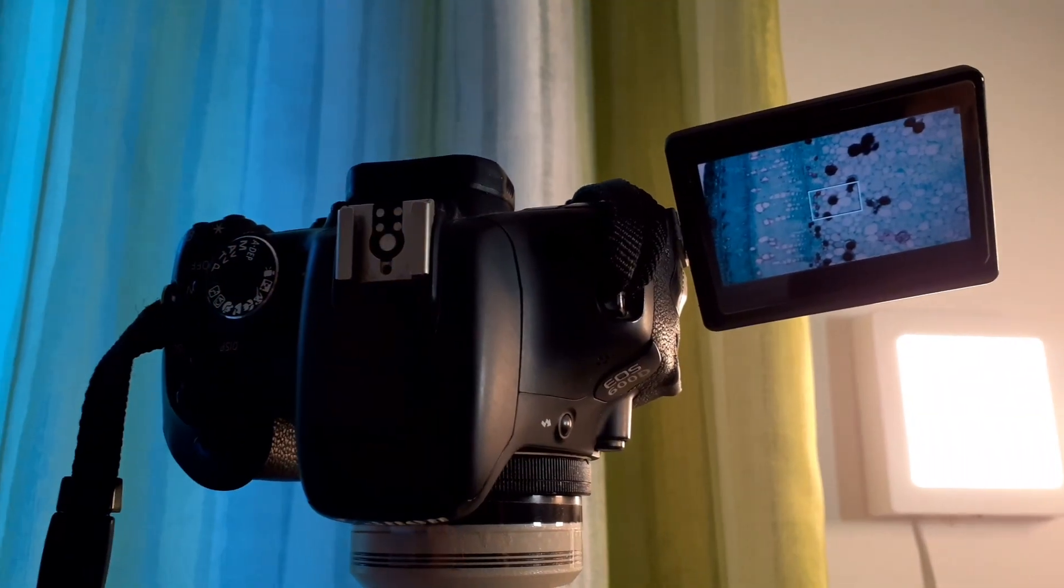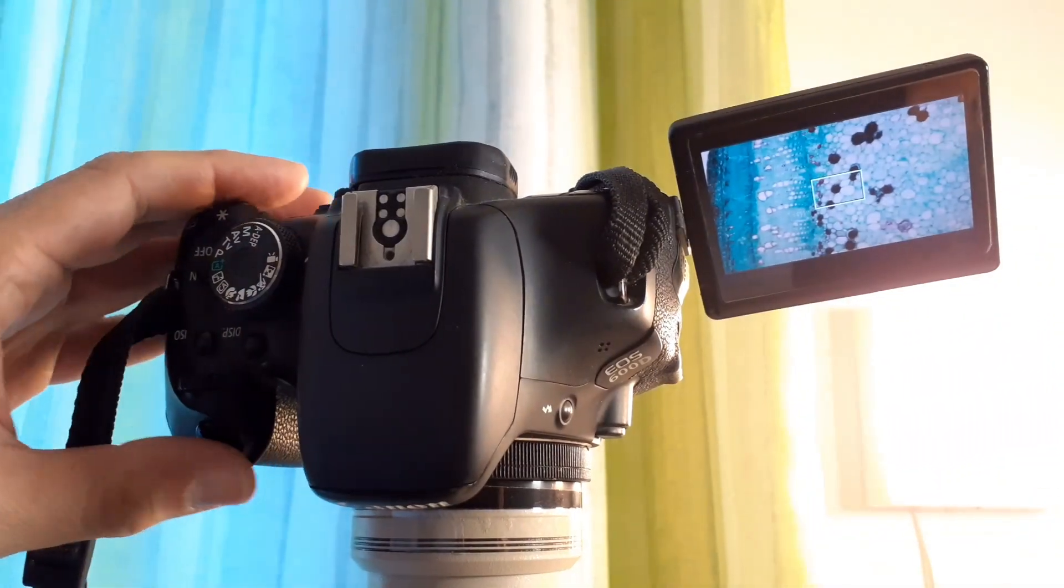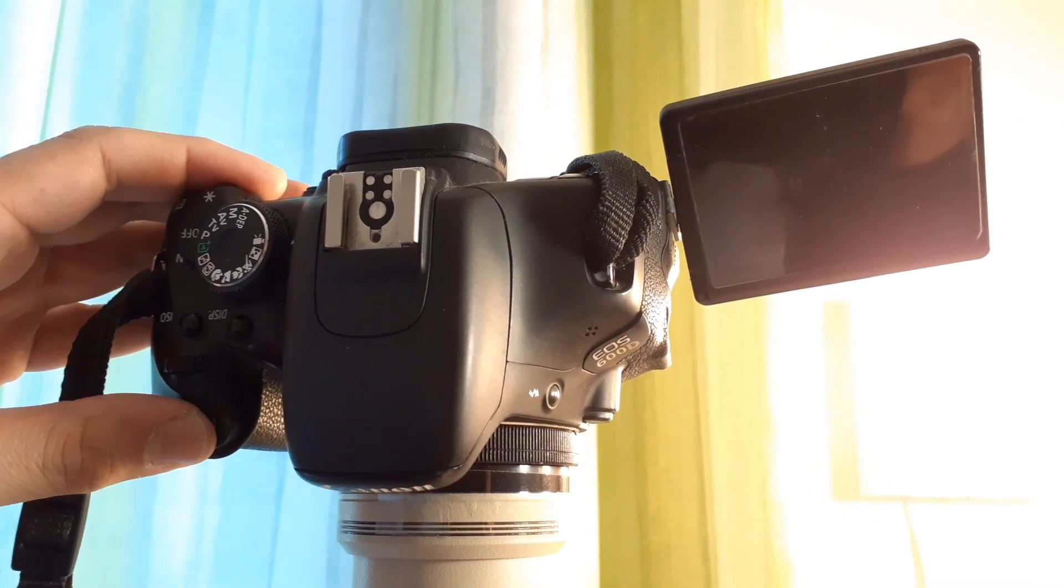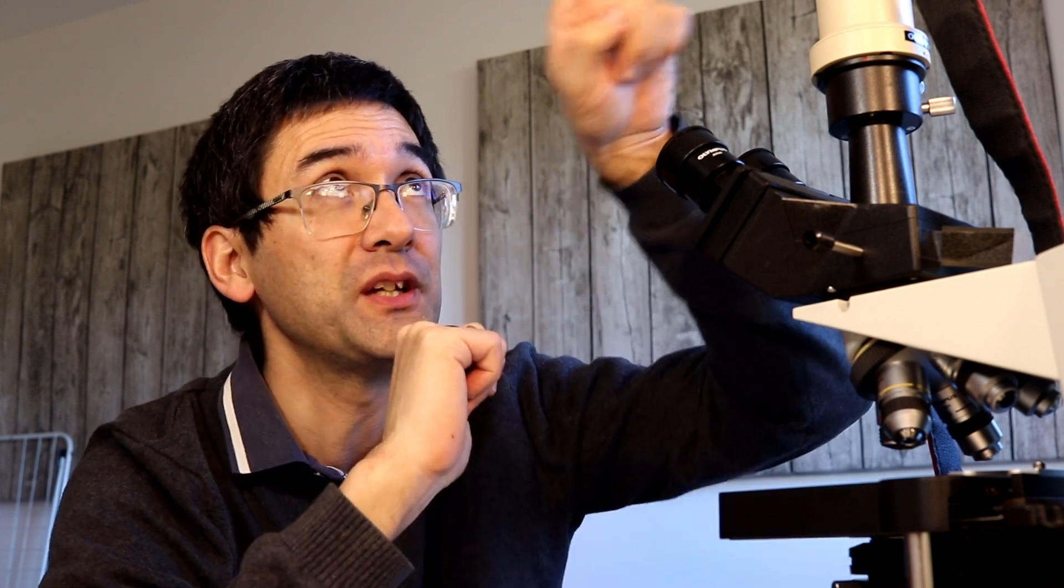In the other case, you have to simply control the mouse, use the mouse and then control the menu that you are displayed on the computer screen. My camera that I have here does have a flip-out screen, and this flip-out screen has an enormous advantage in that I can actually see directly on the camera the picture that I'm filming or where I'm taking photos off. That is also important because I want to do all of the controls and all of the settings, and I want to see that it's properly exposed. I can see this directly on the screen, and then I simply reach up and I release the camera or press the record button, and then it will record it.